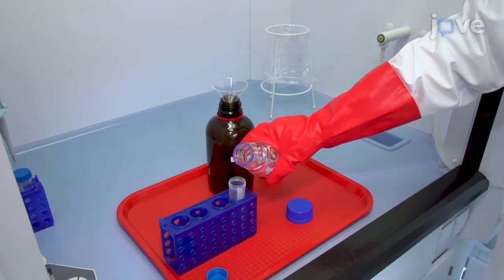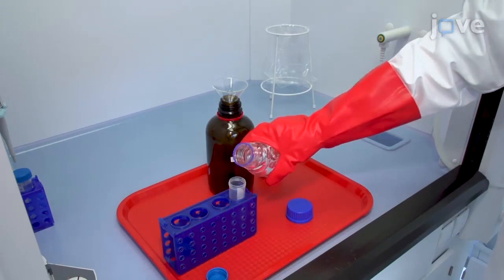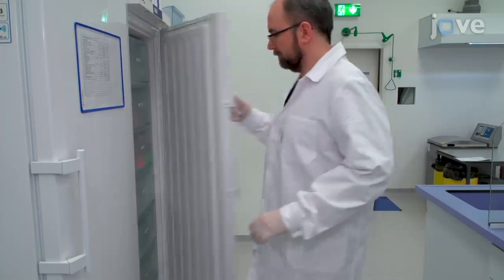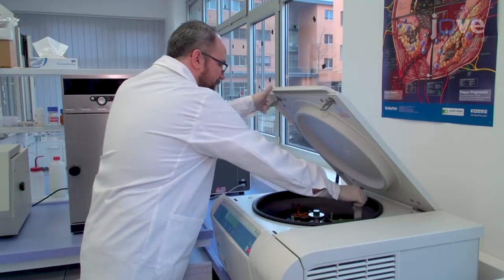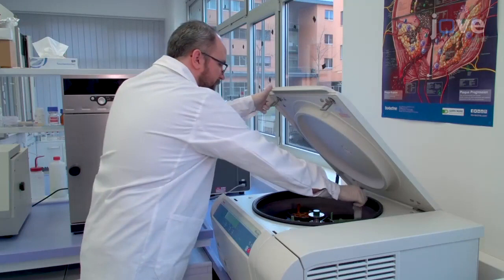Re-suspend the pellet in 50 milliliters of pre-cooled ethanol-diethyl ether mixture and vortex briefly. Incubate a second time for 2 hours at negative 20 degrees Celsius. Centrifuge again at 2500 times G for 10 minutes at negative 10 degrees Celsius.